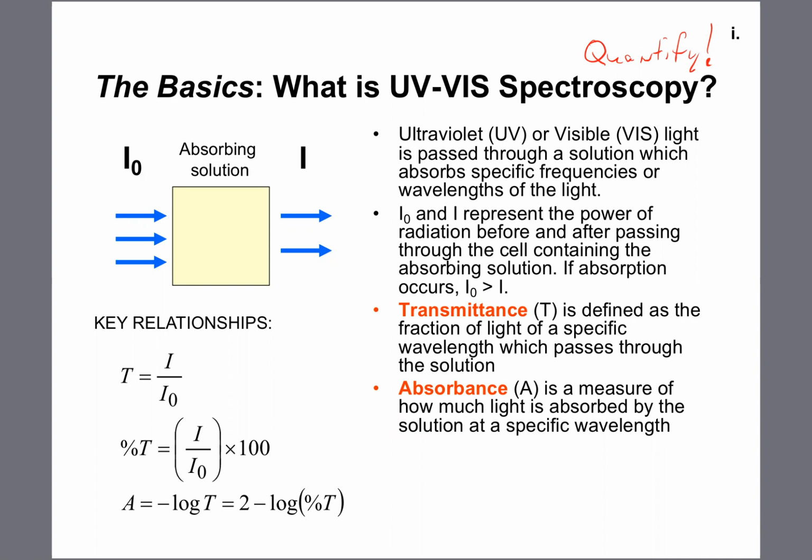So let's start at the beginning, right? Let's just say that we prepare a sample which absorbs light at a particular wavelength. We usually make measurements at a specific wavelength when we're doing these sorts of discussions. So what I'm going to do is take a light bulb. This is my light bulb, okay? I'm not a very good artist, but you get the idea, right? That's my light bulb. And it gives off light of a particular wavelength. Now the intensity of that initial beam is I0. I call it the incident beam because it's incident or directed towards my sample, which is this yellow box.